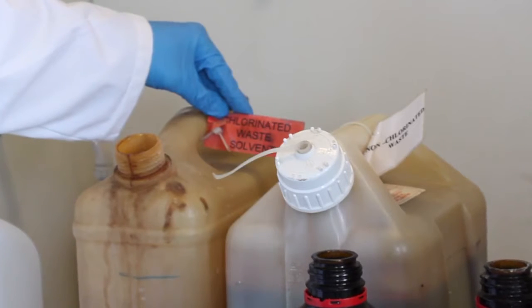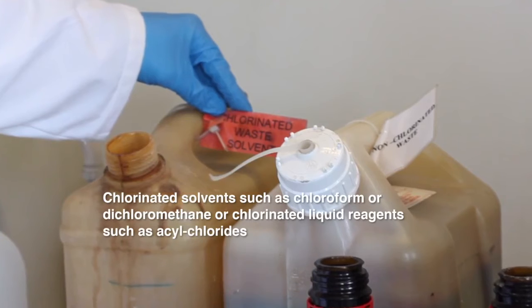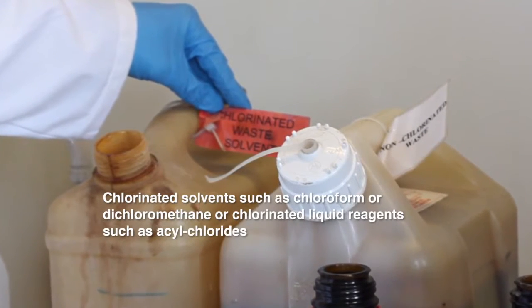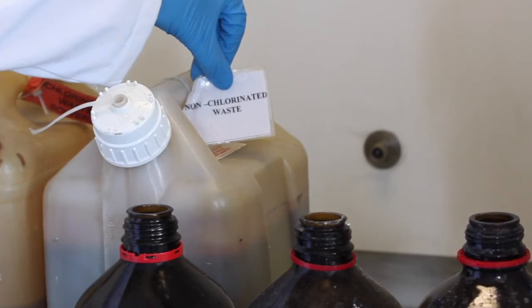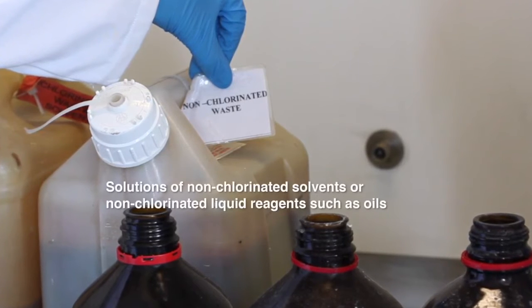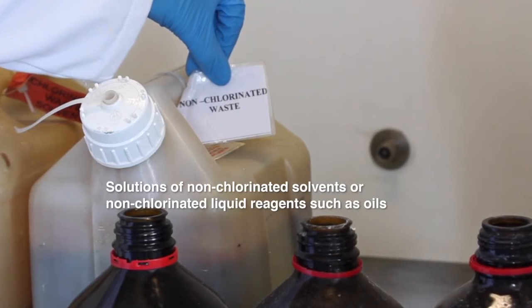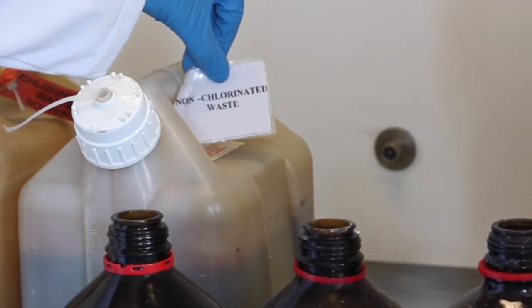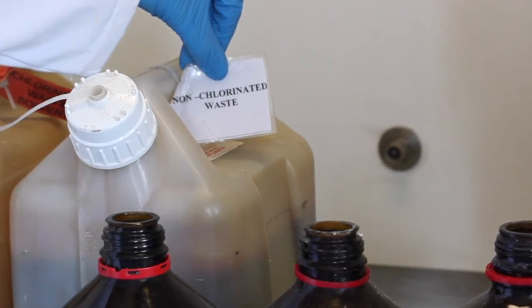In the chlorinated organic solvent container, you can dispose of all chlorine-containing solutions such as chloroform or dichloromethane or chlorinated liquid reagents such as acid chlorides. In the non-chlorinated organic solvent container, on the other hand, you can dispose of all solutions of non-chlorinated solvents like ethanol or acetone or non-chlorinated liquid reagents such as oils. Furthermore, you can use this bin to wash your glassware or equipment with an appropriate solvent.